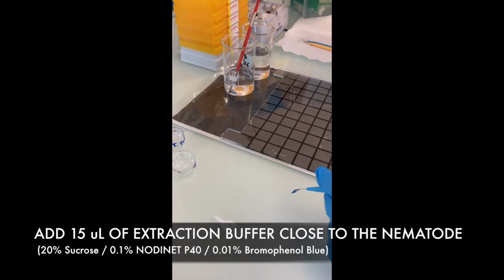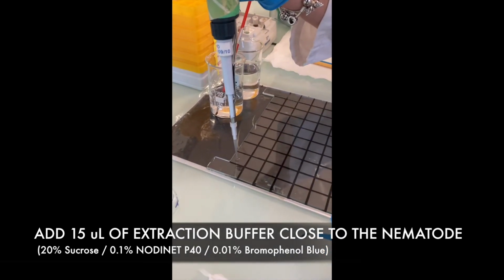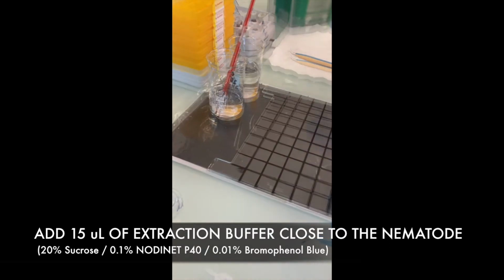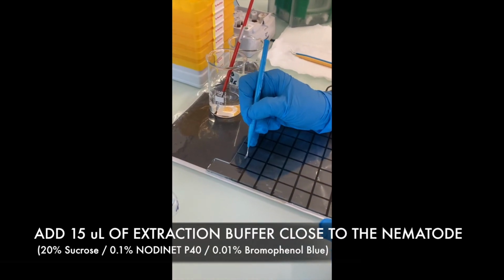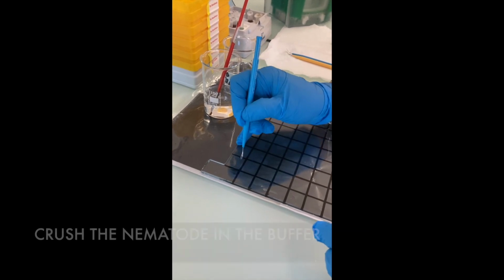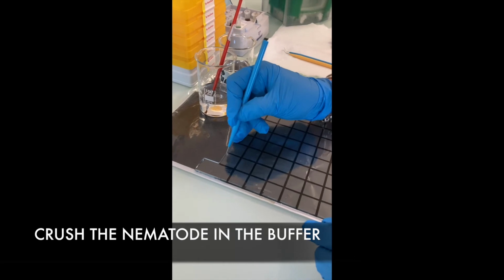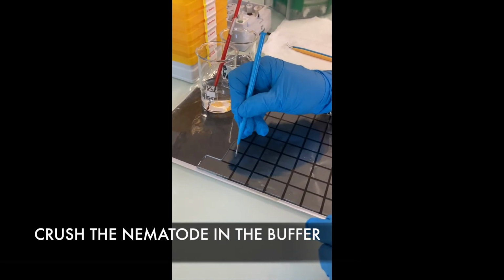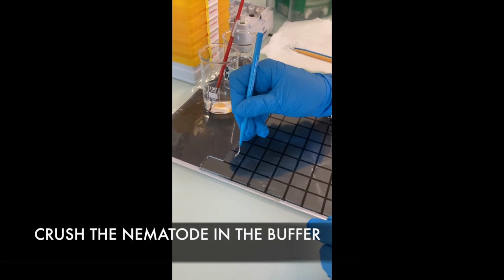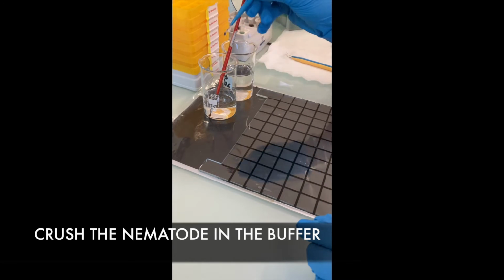Add 15 microliters of extraction buffer right next to the nematode. The buffer consists of 20% sucrose, 0.1% of Nonidet P40, 0.01% of bromophenol blue. Now you can crush the nematode in the buffer, collect everything and load the samples directly in the first well.